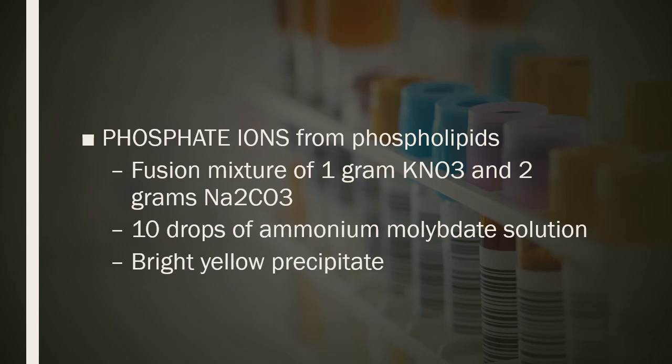And so if you recall, previously you did this one. In your bile, what else? You have others, even in saliva. And so you did this, okay? And with this, this is actually a test for your phosphate ions.